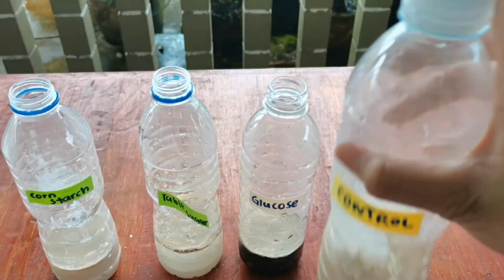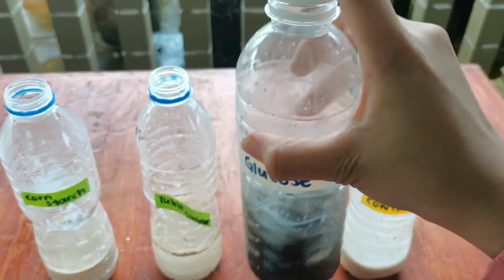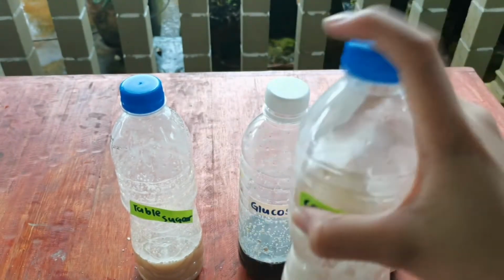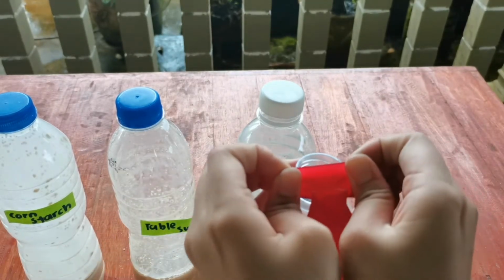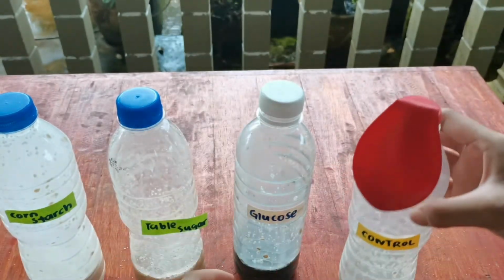Mix them by putting a thumb over the top of the bottles and gently shaking. Then, the opening of each bottle is covered with a balloon to capture the gas produced during this experiment.